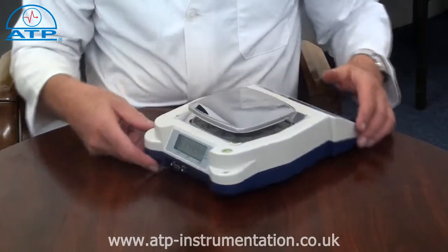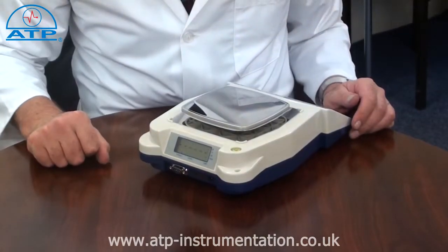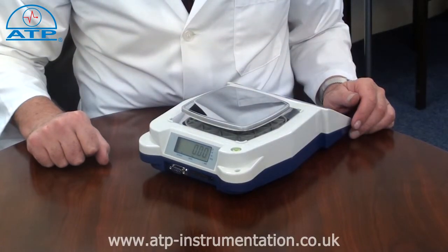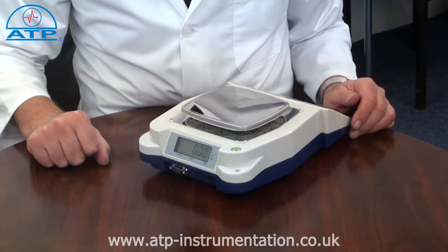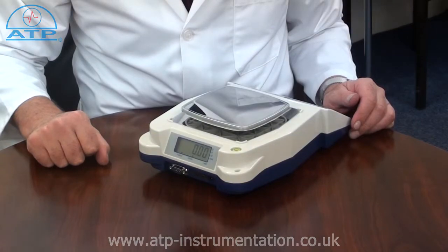An RS232 interface facilitates the transfer of data to a PC or laptop. The software is available as a download free of charge from our website. The RS232 connection cable is supplied as an optional accessory.